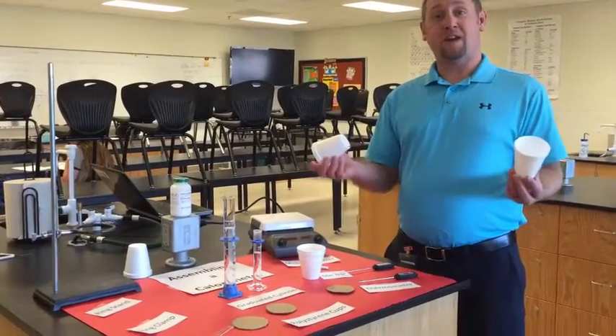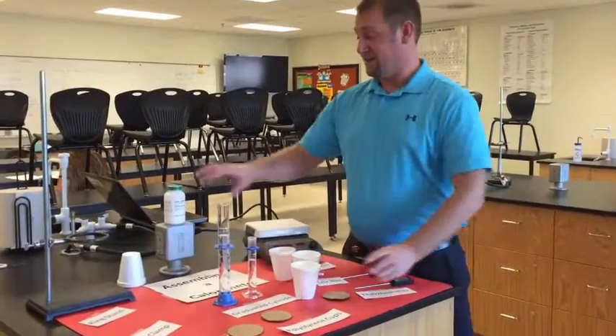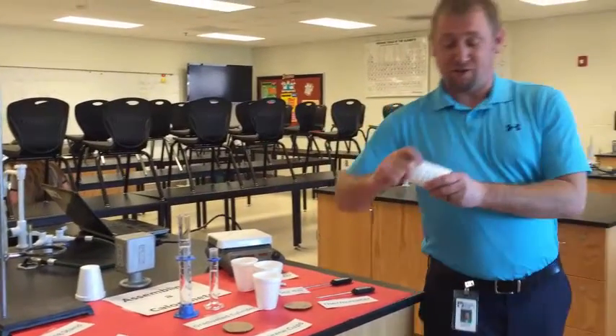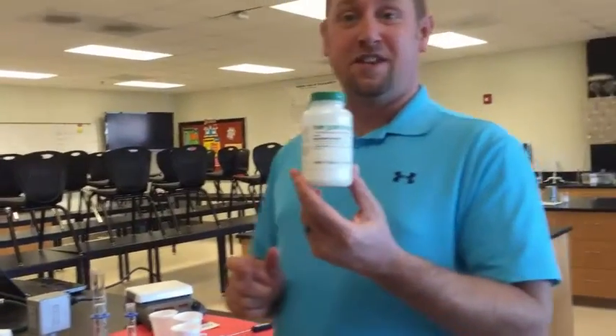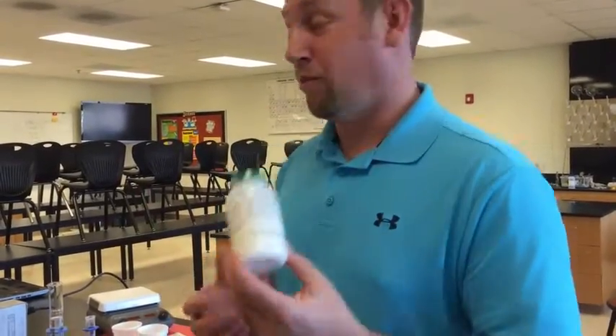Today we're going to demonstrate how to make a calorimeter out of styrofoam cups. The reason you're doing this is to determine how much heat is released when you mix a solid with water.